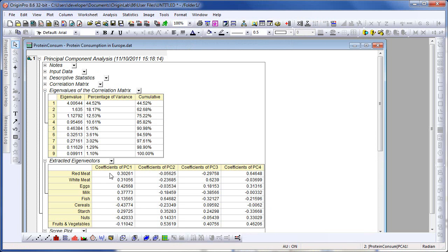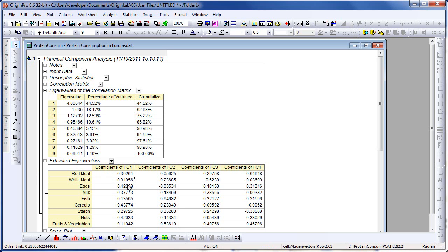If we now look at the extracted eigenvectors table, which displays the composition of each principal component — in our case the four components — in terms of the original set of nine observed variables, which were the nine sources of protein: For PC1, the composition is mainly animal protein: red meat, white meat, eggs, and milk. The second component, PC2, is primarily fish and fruits and vegetables. For the other two components, PC3 and PC4, the separation is not so clear.